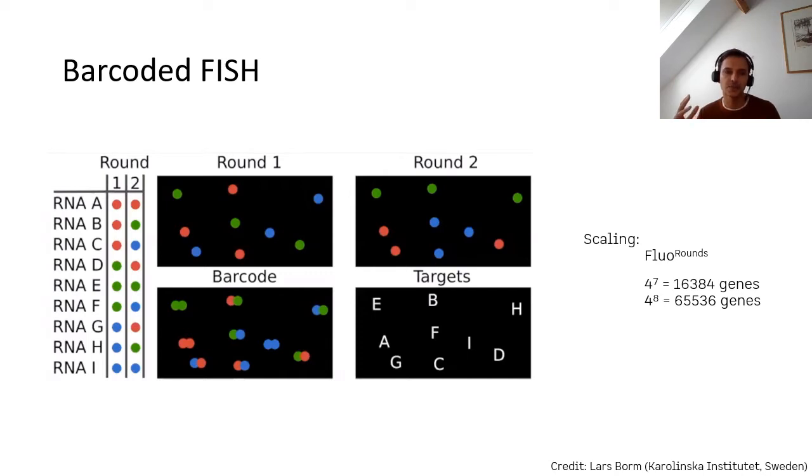For example, for transcripts originating from gene B, we know upfront that in the first round we expect a red signal, and in the second round a green signal. At the very end of all these individual rounds, you take all these individual fluorescent readouts and consider them as a barcode. You decode that barcode and you can assign the identity of those transcripts to that gene.